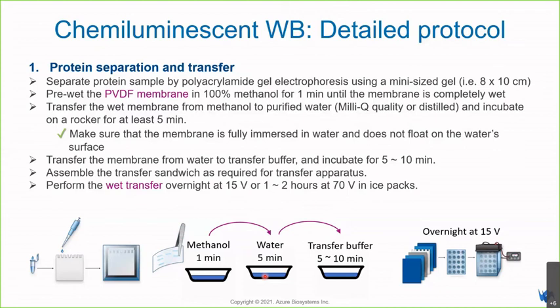You can use either Milli-Q quality or distilled water, and incubate the pre-wet membrane in this tray for at least 5 minutes on a rocker with gentle agitation. Make sure that the membrane is fully immersed in the water and does not float on the surface. Then transfer the membrane to a tray filled with transfer buffer and incubate it for 5 to 10 minutes.